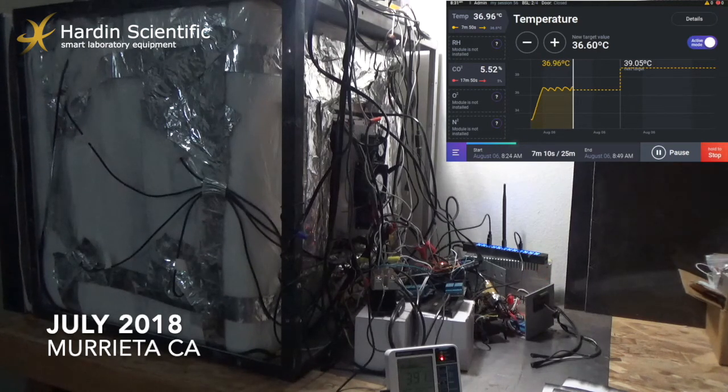So you can see the concentration of CO2 in the room. Right now it's 393 ppm. This is like 0.03, I guess, concentration, so very low. And this is a good thing because we don't have any leaks. We just keep the concentration inside the chamber, not in the room. So this is a good thing.